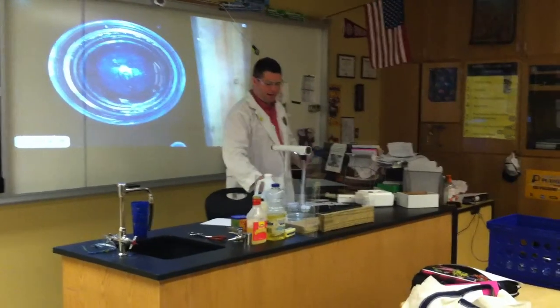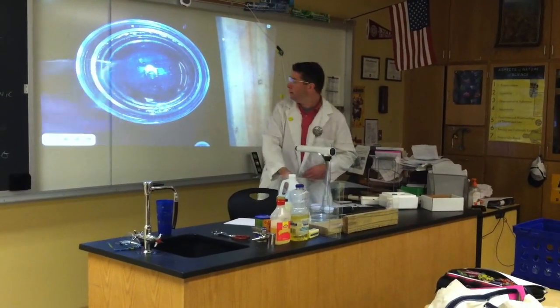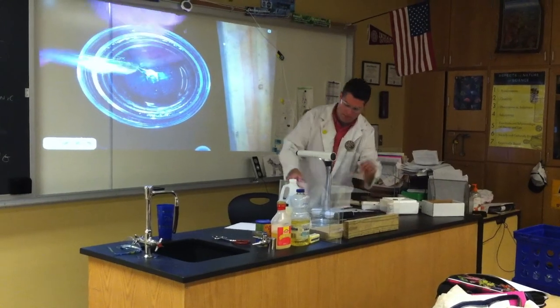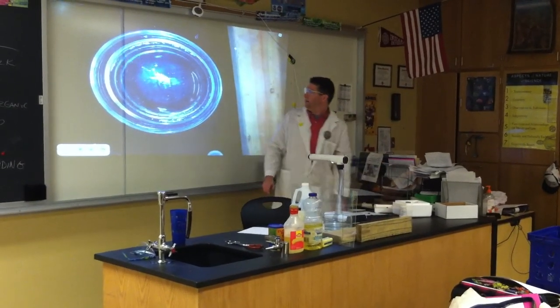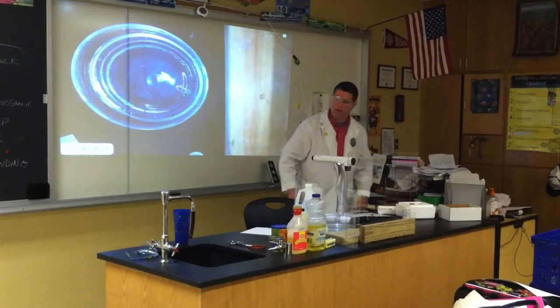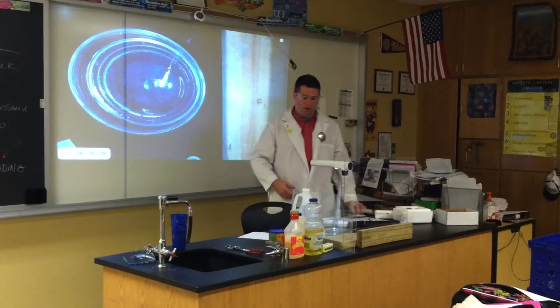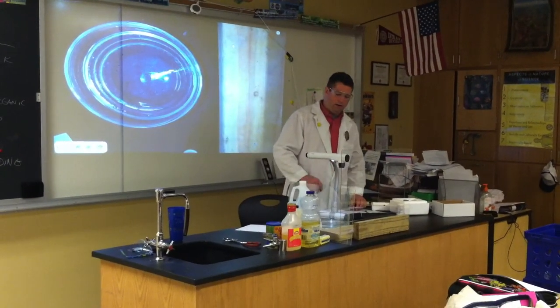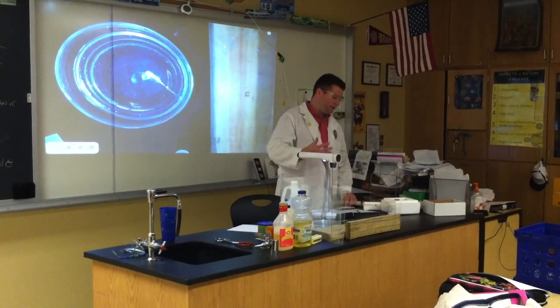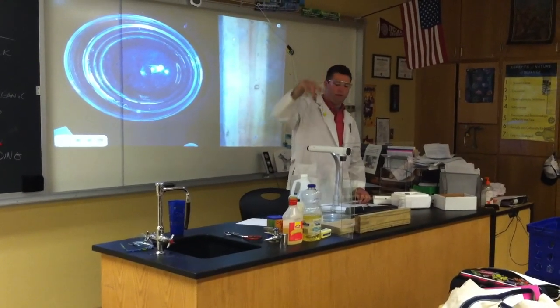So what you're going to see when this reacts is that it actually starts spinning and going in circles, and that is hydrogen gas coming off the water. That's how reactive it is. All right, so that's just a very small piece. And lithium, remember, is less reactive than sodium because it's at the top.